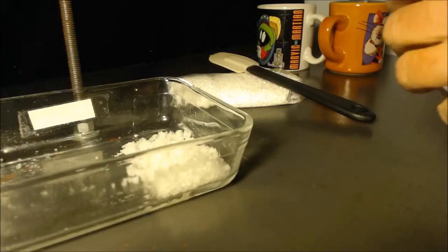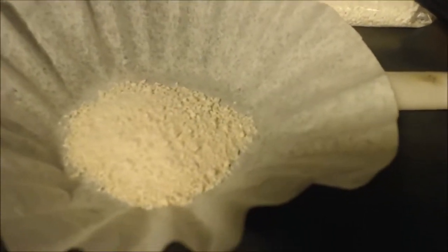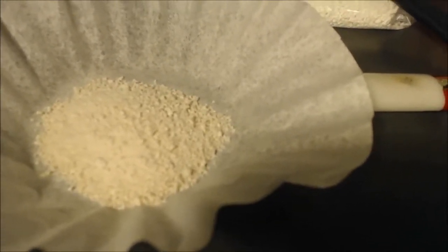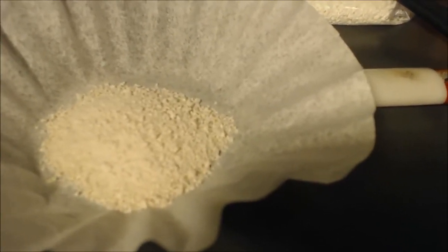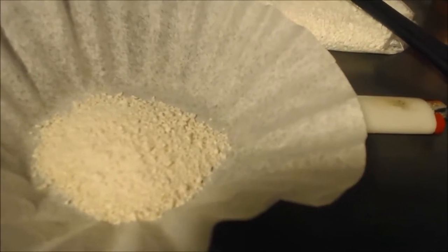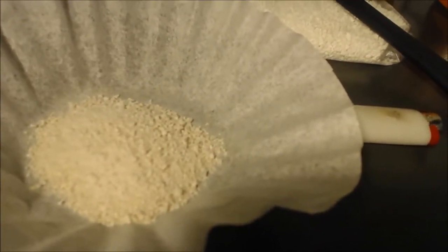Oh, wait, I gotta dry it. You can see nice dry white crystals. I got 28 grams there. When I recrystallized from water, I had 27 plus 1 gram I left in solution that I was going to discard. But that wasn't pure. This should be 76% the acetate and 23% the carbonate.